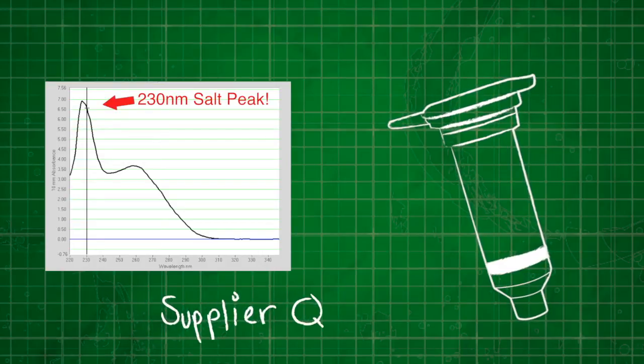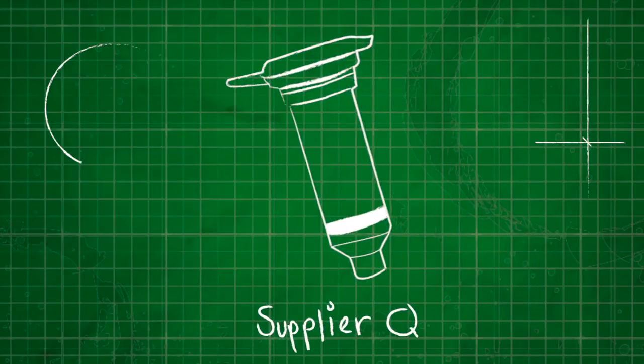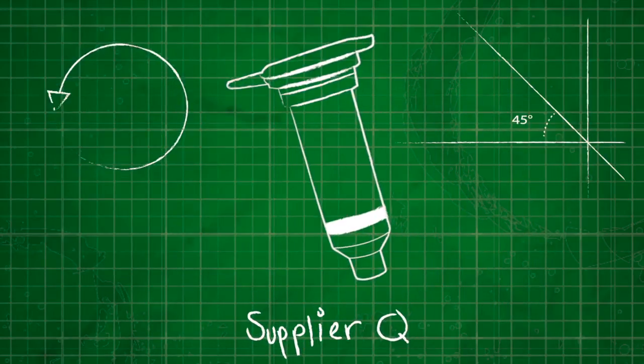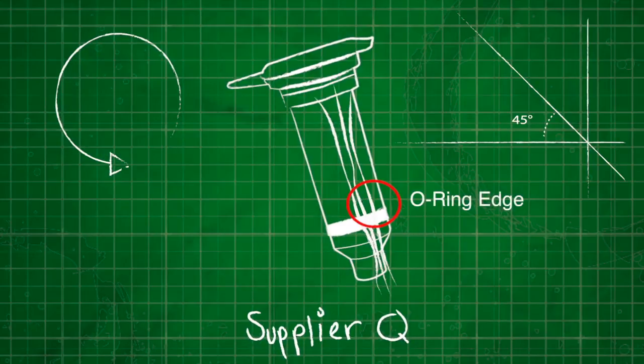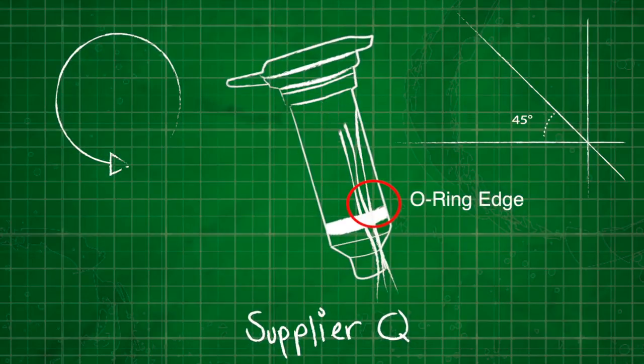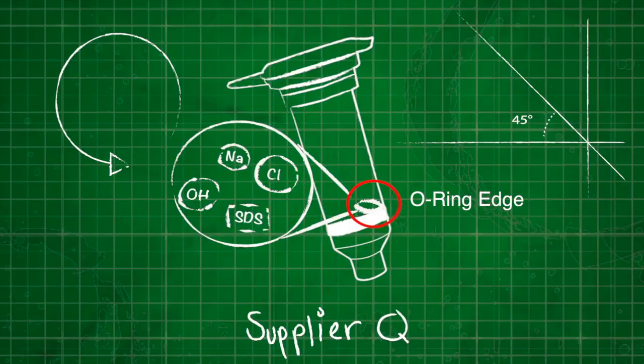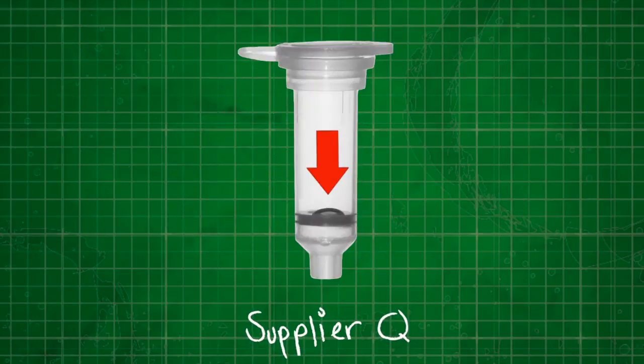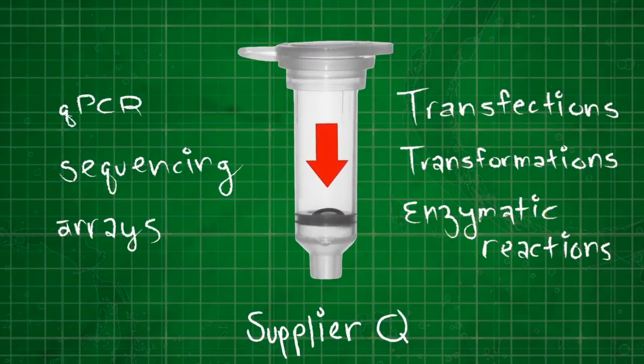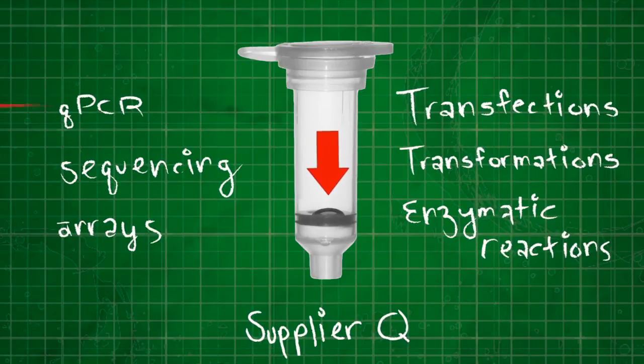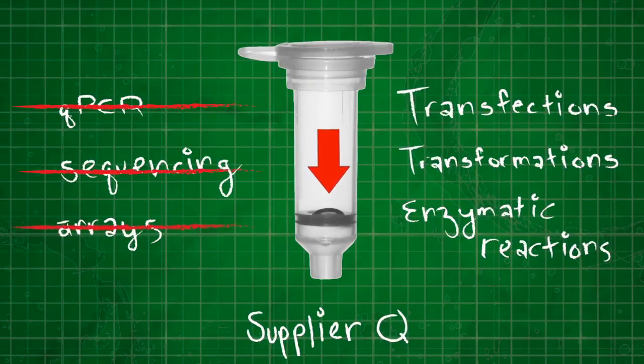How does this happen? Because spin columns go into the centrifuge and are spun at an angle, the o-ring that holds the matrix down allows for retention of buffers and contains salts, detergents, and inhibitors that can potentially affect sensitive downstream applications, such as qPCR, sequencing, arrays, and more.